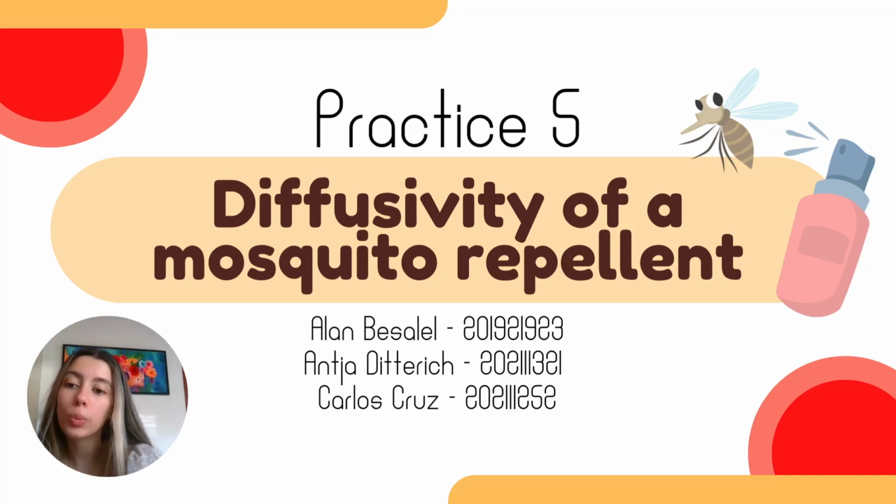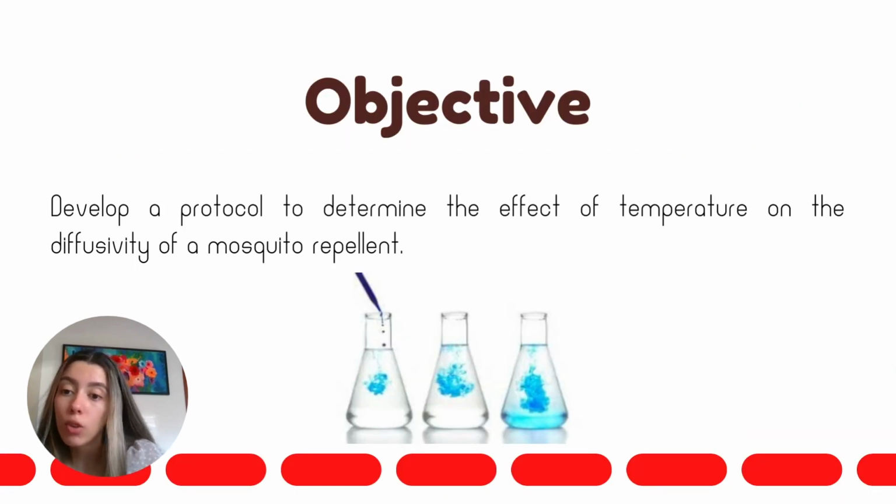Hi, we are going to present to you practice 5, the diffusivity of a mosquito repellent. The objective of this practice was to develop a protocol or a methodology to determine the effect of the temperature on the diffusivity of a mosquito repellent.